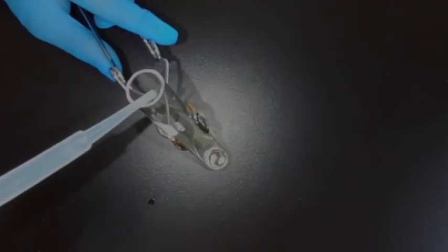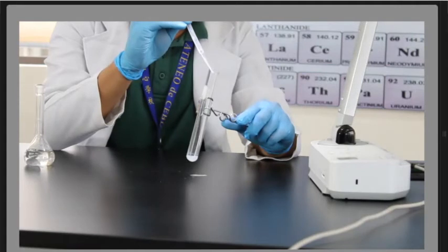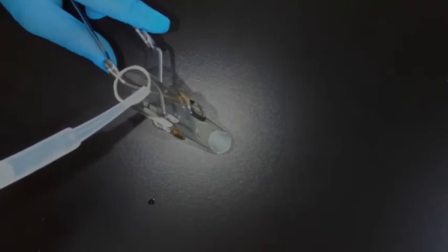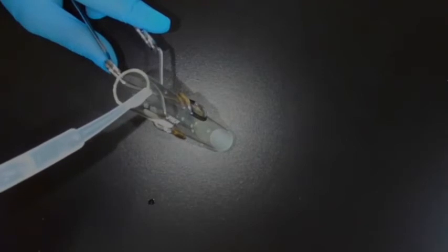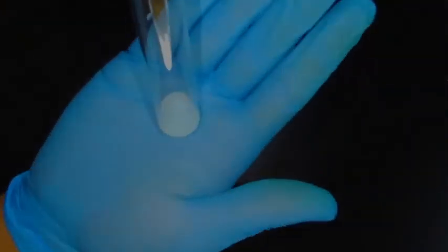So that's 20 drops of sodium carbonate. So observe the reaction. What happened afterwards?